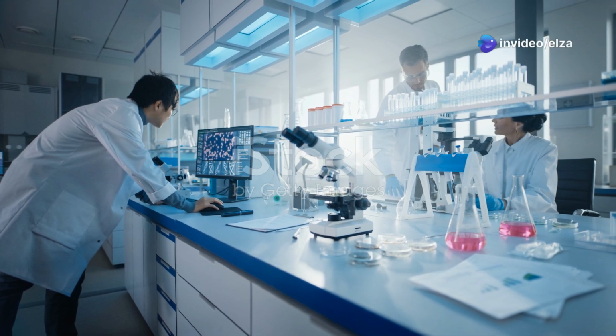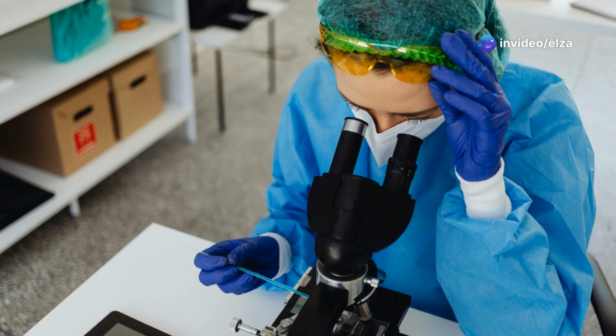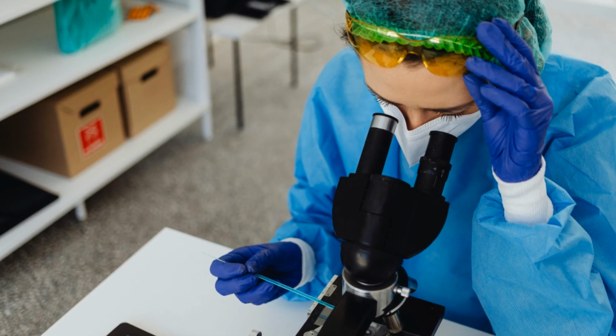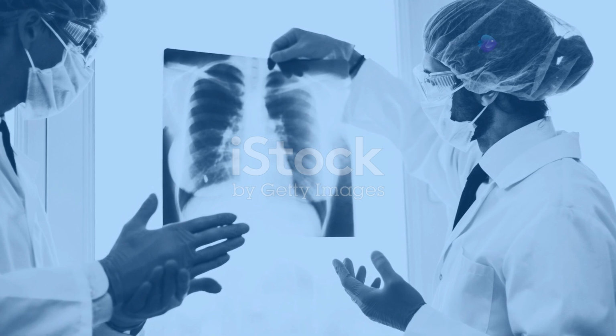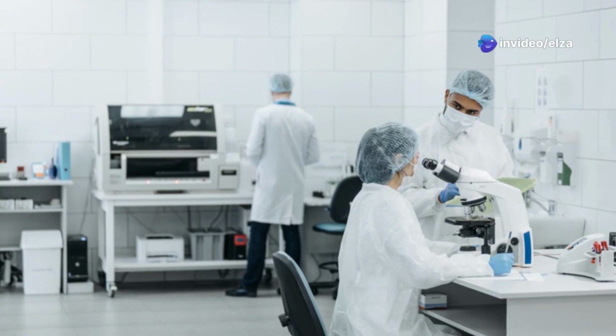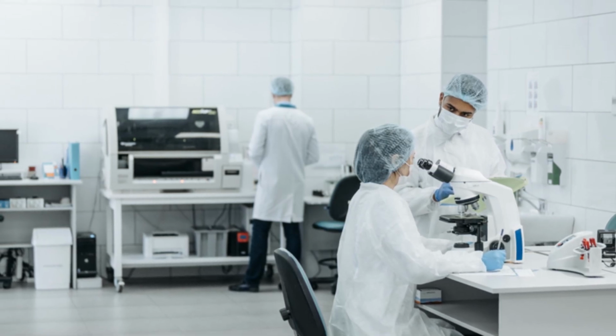Autoradiography has proven to be an invaluable tool in various scientific disciplines. In cellular and molecular biology, it is used to study various cellular processes. It allows researchers to track the movement of molecules within cells and investigate gene expression patterns. In drug discovery, autoradiography helps study drug distribution and target engagement.